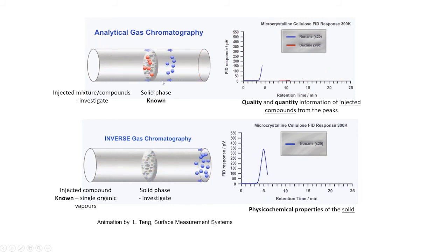What this is hoping to do is to separate our mixture of gases into fractions. From the location of the peaks in this type of chromatography, we identify what the gas is, and from the area underneath these curves, we find out how much of that gas there is.